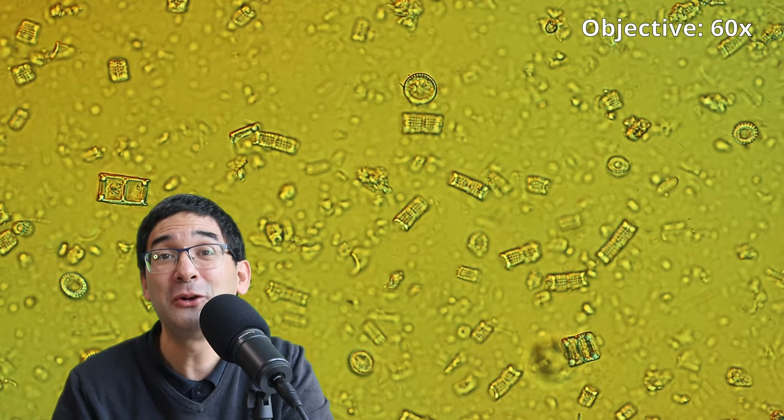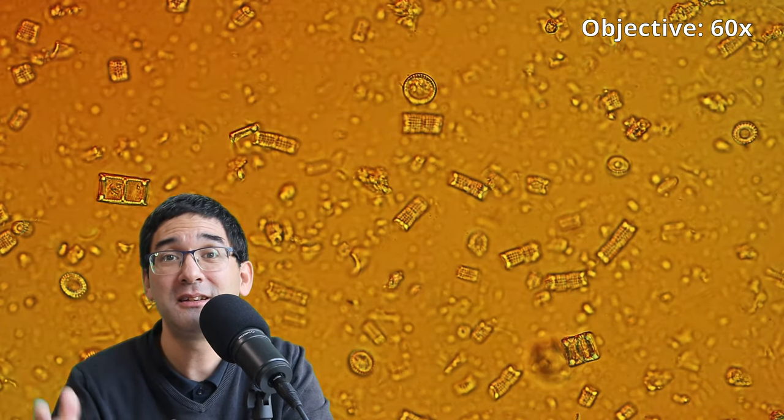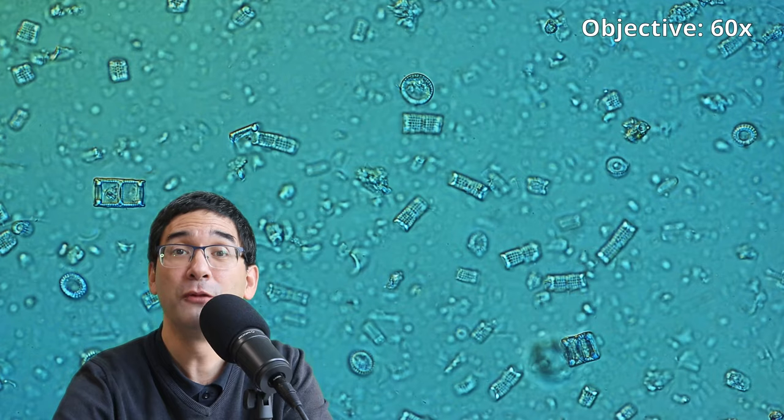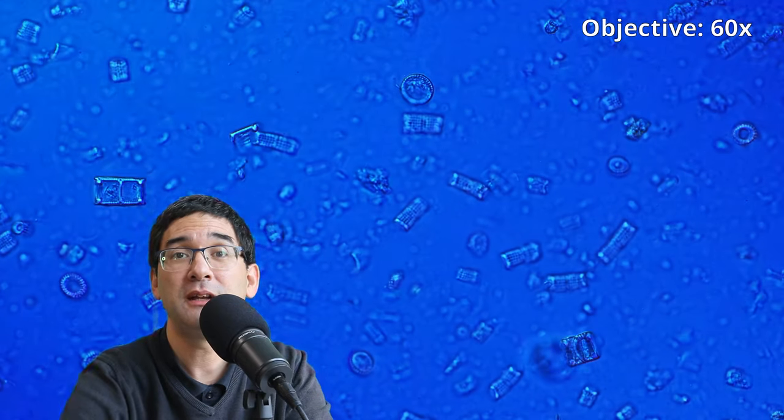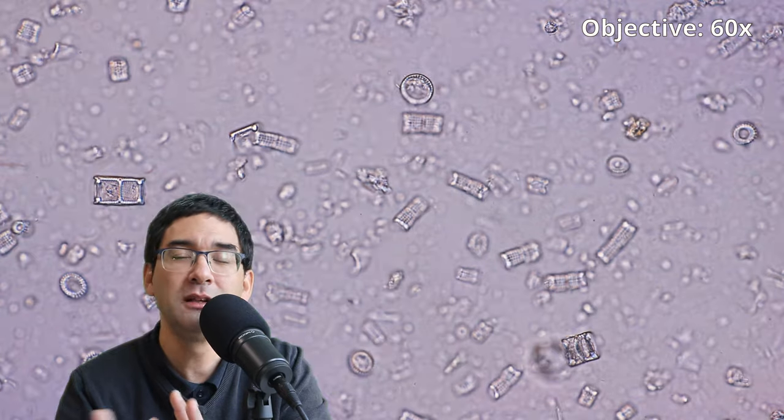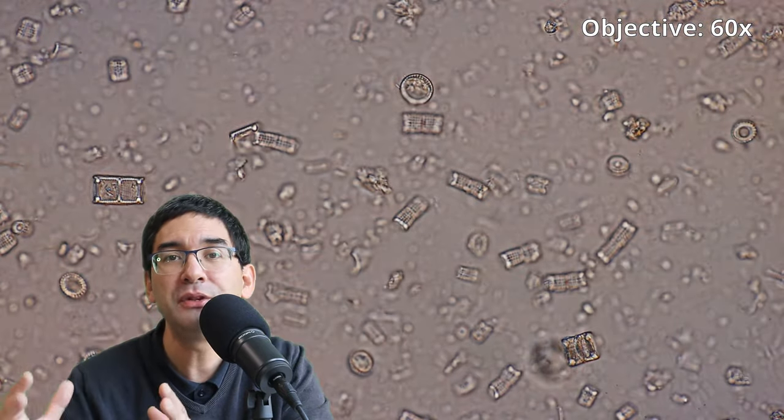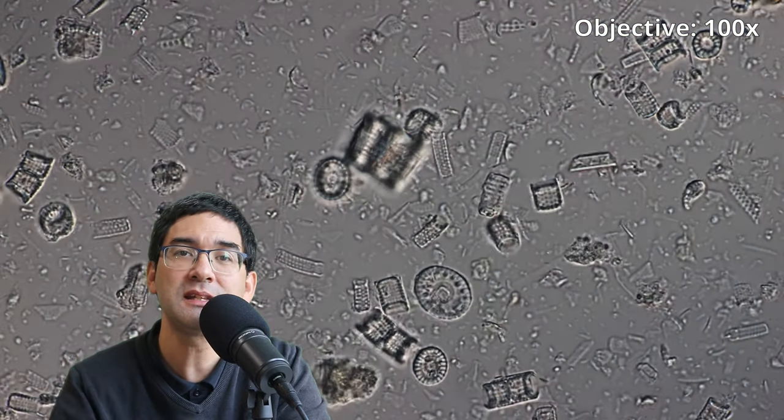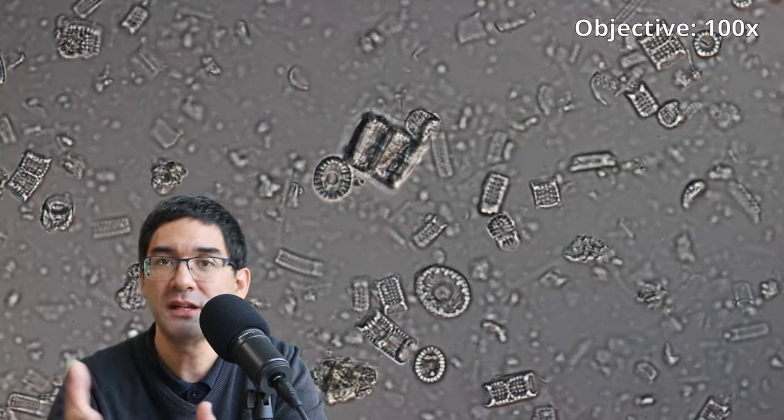Now, diatoms are not polarizing, at least the ones that I have here, they are amorphous. And therefore, they are not optically active. And therefore, it can also be a little bit difficult sometimes to see them, especially if the surrounding mounting medium has the same refractive index as the cell walls, as those diatoms here.